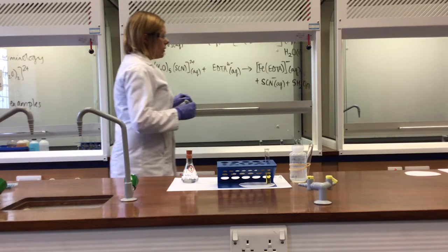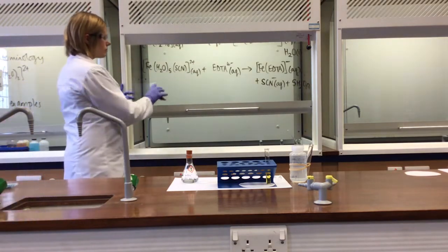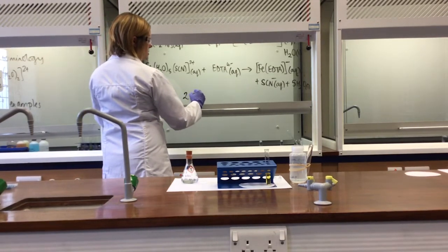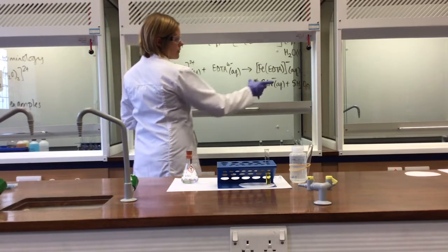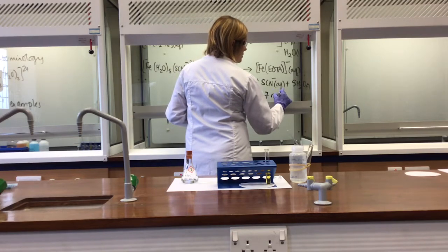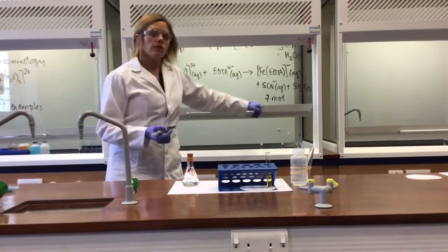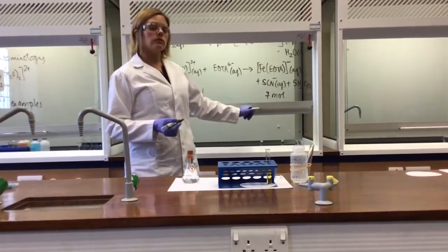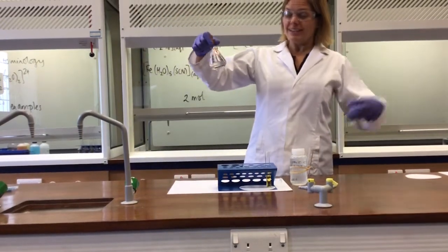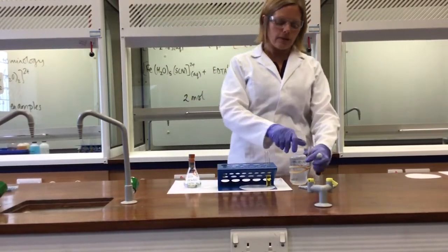liquid. Notice the number of moles of substances on each side of this equation. On the left hand side we've got 2 moles of substances, and on the right hand side we've got 1 and another 6, which is 7 moles. So by doing this ligand substitution reaction, there's an enormous increase in entropy, increase in disorder of the system. And that drives it. That's why this EDTA substance chelates, it's got the chelate effect, attaches so strongly to that central metal ion, that Fe3+ ion.